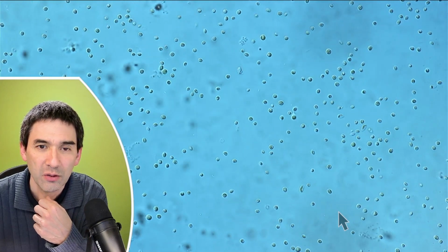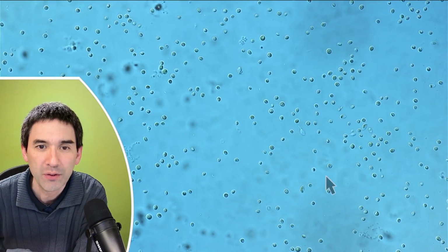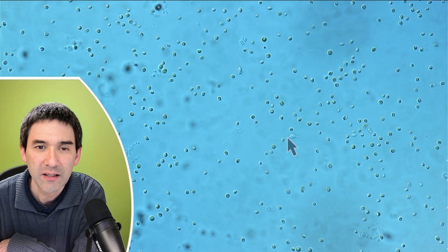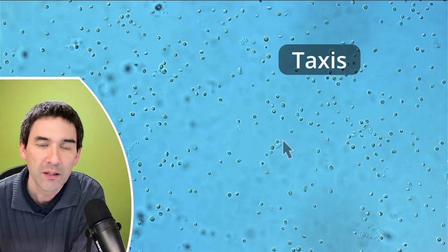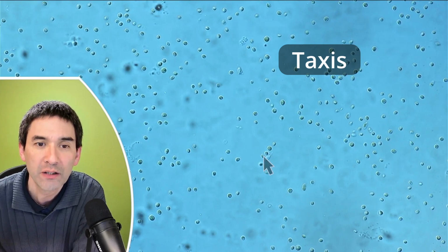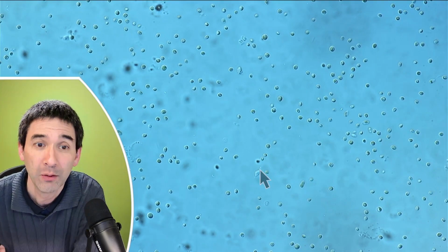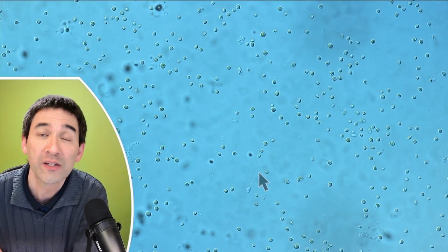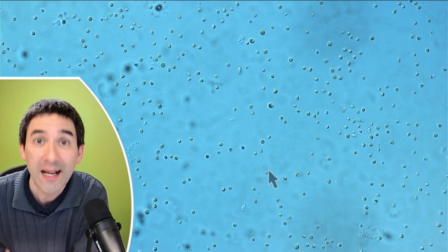Okay, so look, that's a tiny one. It's a flagellate. I'm just going to point the arrow. This tiny guy over here, right? Maybe you see this tiny extension that it has. This is called taxis. Microorganisms move on their own, also directionally, towards a favorable condition, more oxygen for example, towards food, away or towards light, and this is kind of a directional movement, and it's called taxis.